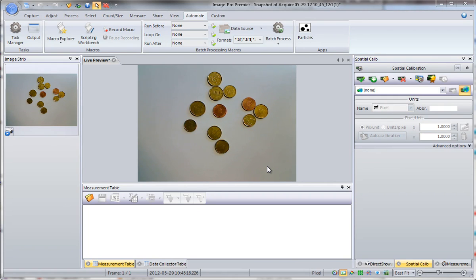Hi, I'd like to introduce an app called Particles. Using this app you can count objects on a live image and collect data to the data collector, or count objects on a sequence.